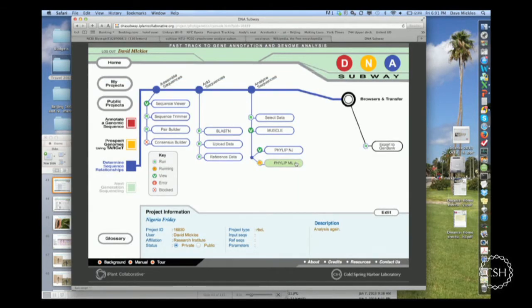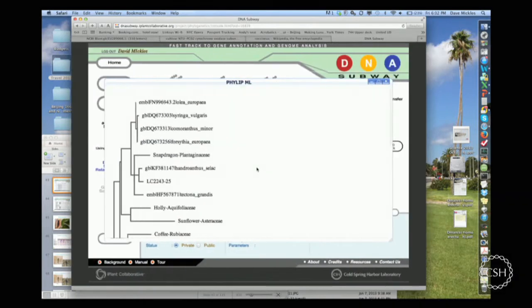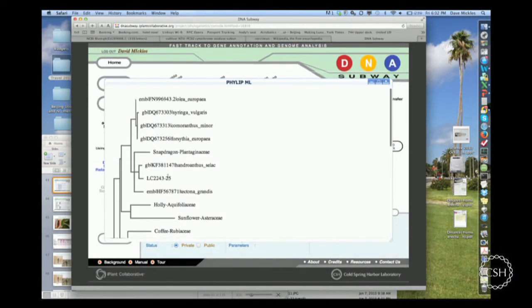I just want to see if all of those close matches shake out together, which I'm expecting that they will. And there's the closest match here. And the other match is somewhere else. So it's showing that the affinity between these two sequences might not be as simple as you just judge by your eye.